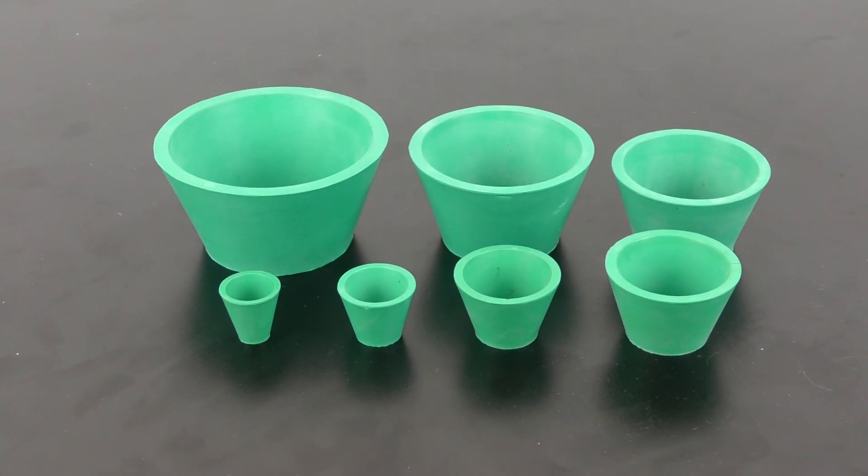This synthetic rubber filter adapter set is specially designed to fit Buechner and fritted glass funnels, porcelain filters without headpieces, and for reverse flow cleaning of filter crucibles. They can be used individually or nested with adjacent sizes. They are also autoclavable and easy to clean. They provide an excellent alternative to boring special size holes in rubber stoppers.